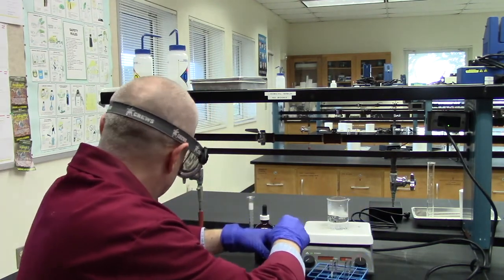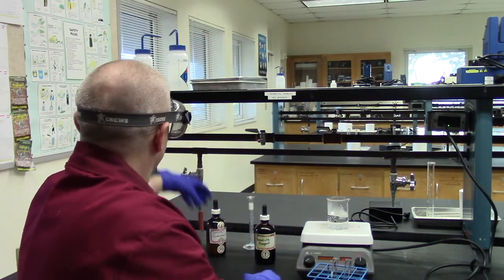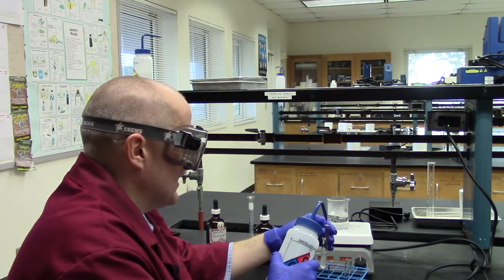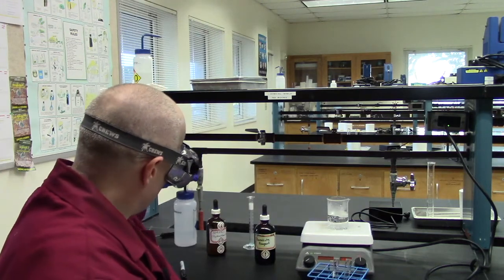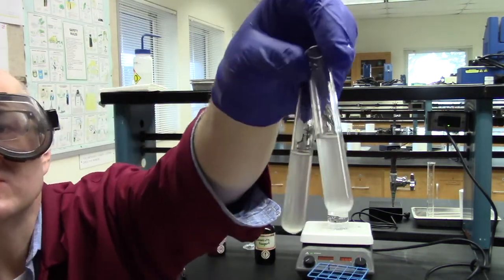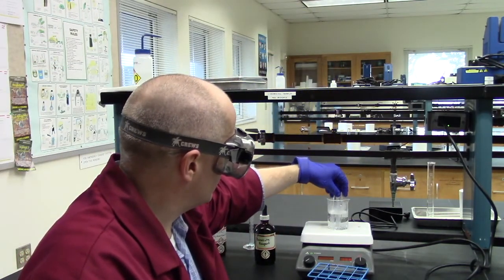Give that a little shake. And now I'm going to add some water to the one labeled water. Just going to use a squeeze bottle for that. 5 drops, best I can. There we go. That's about 5 drops. A little more than that, but that's okay. And now I'm going to put them into the hot water. As you can see, they haven't changed much. They really didn't change at all.